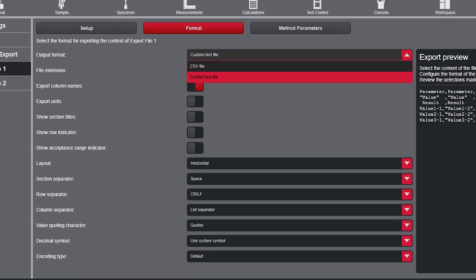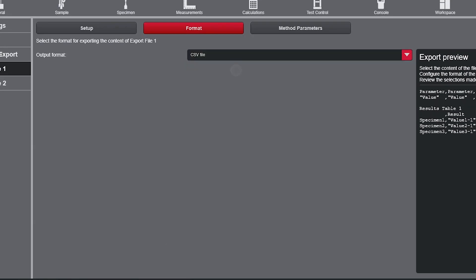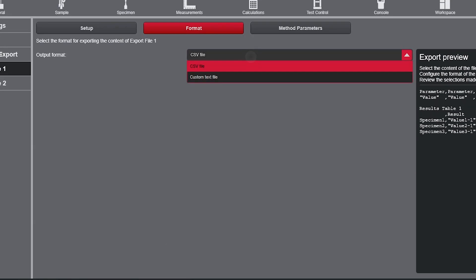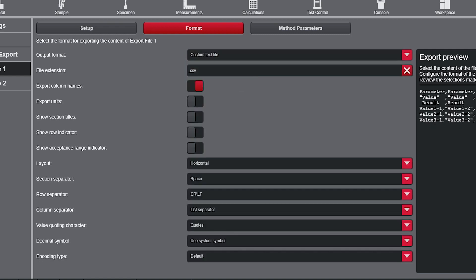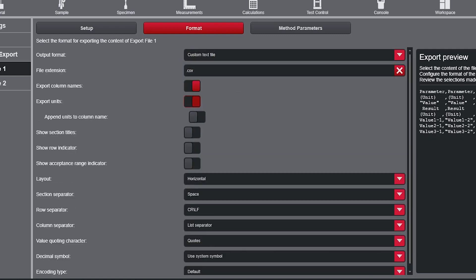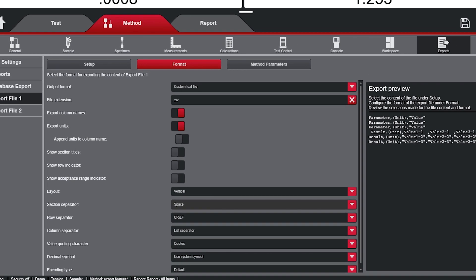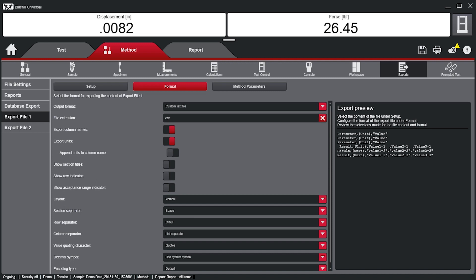Under the Format tab, users can specify the output file format. While the default file is a CSV file, users have the ability to create a custom text file to allow for complete customization and seamless integration with a database or LIMS system.